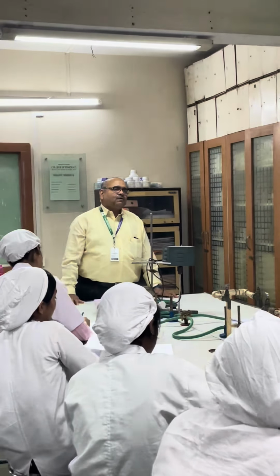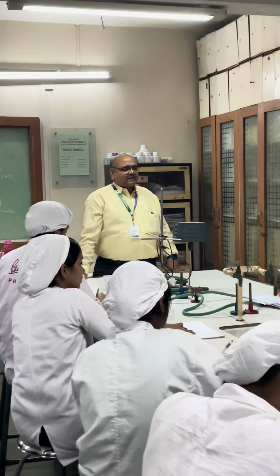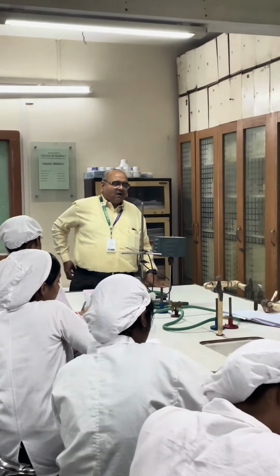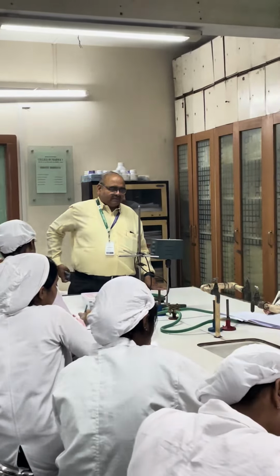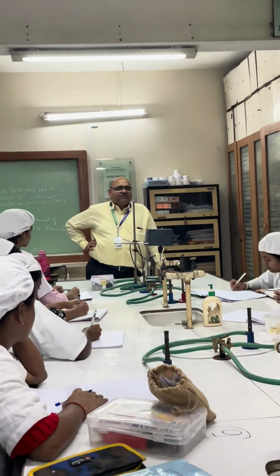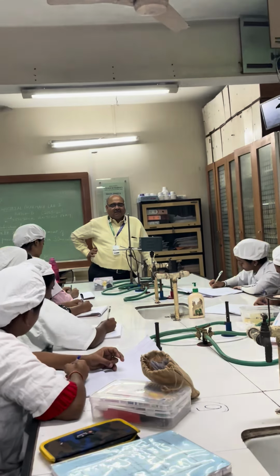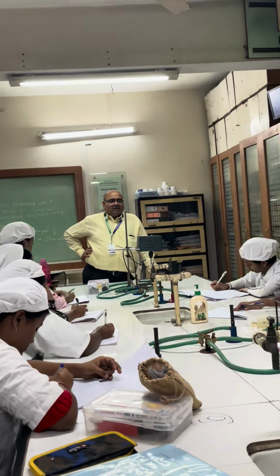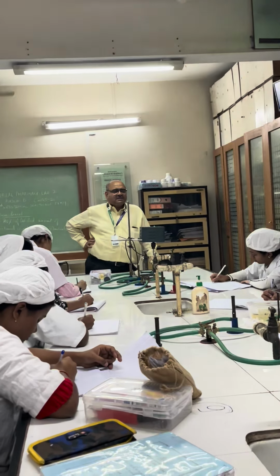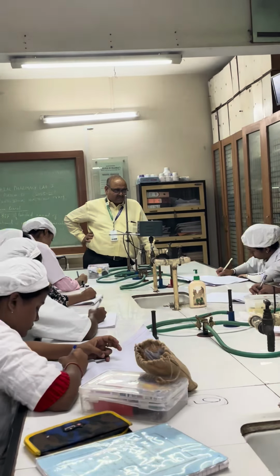Confirmed test will be carried out using BGLB medium. Confirmed test will be carried out by using BGLB medium or EMB agar medium. BGLB medium shows the presence of coliforms. In case of EMB agar, when small translucent metallic shining colonies are seen, it indicates coliforms are confirmed.